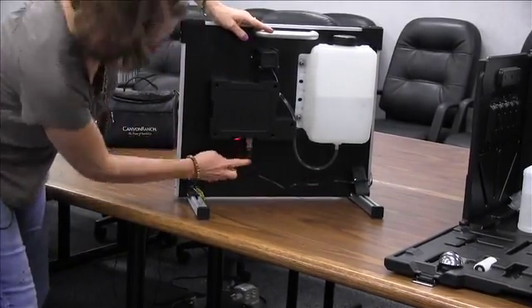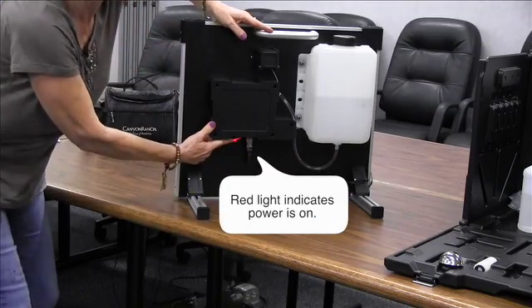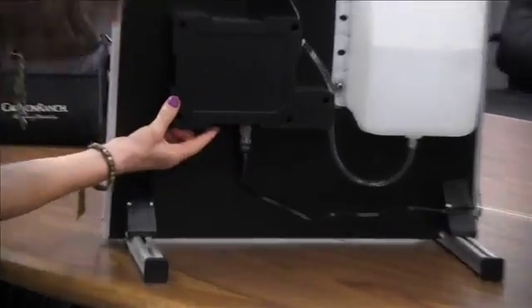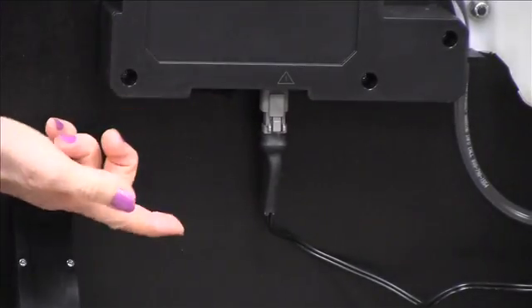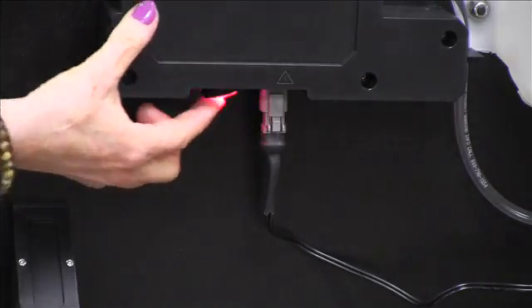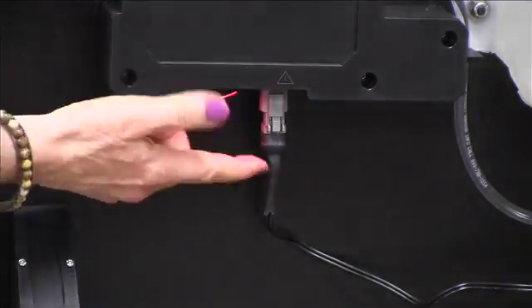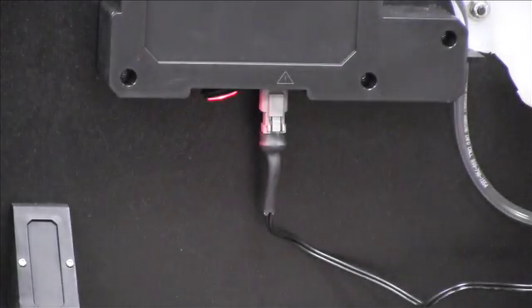If it is plugged in, you will see a red light if you have power. There is an on/off switch back here, so if you are not getting the red light, see if you can toggle on that on/off switch. Now you know that your unit does have power.